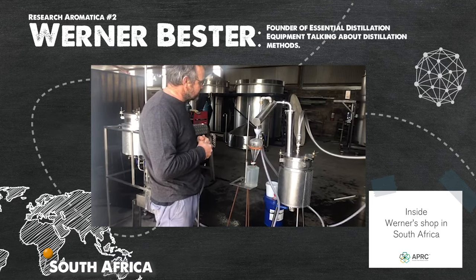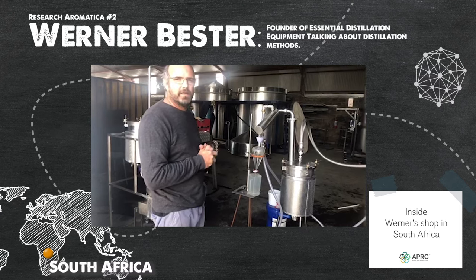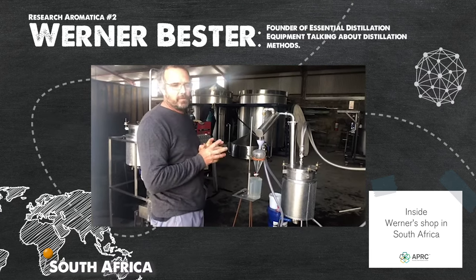This is a hydro distillation system, which will be for frankincense. Once again, just to establish the distillation times and yields for frankincense for a client that we are currently working for.